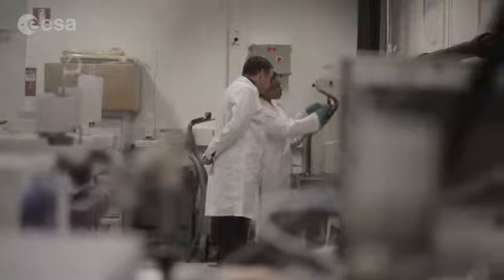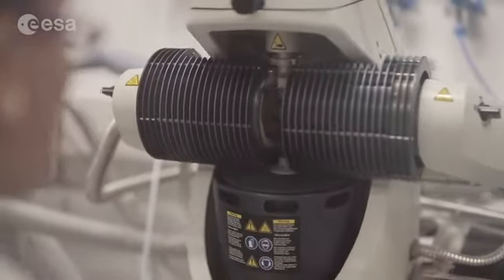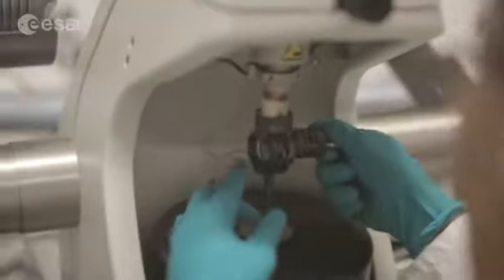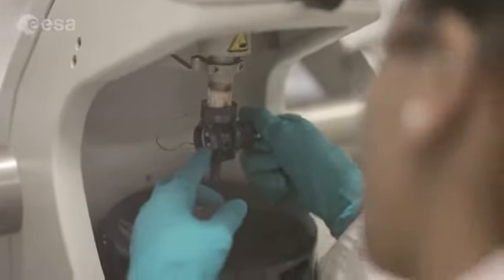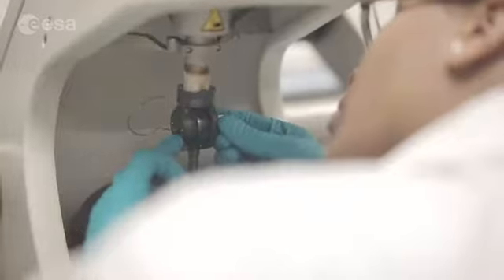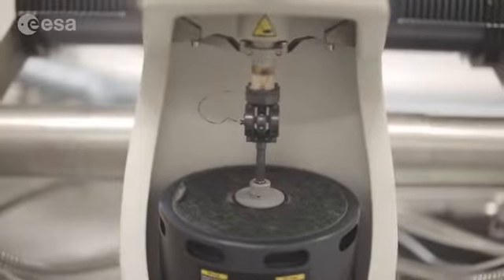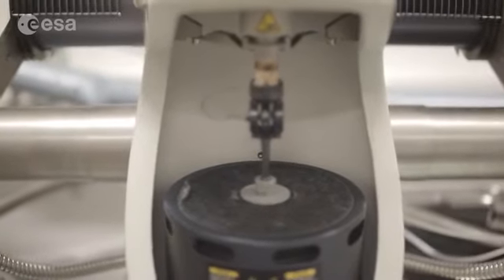Thermal analysis is a way of looking at the material's response to a range of temperatures. And often we have to use more than one technique to understand this. DMA is dynamic mechanical analysis, and it looks at how a material responds to a dynamic environment, i.e. we apply a load and look at the mechanical response of that material. And from that, we estimate the viscoelastic component of something called the modulus, which is really just stiffness.